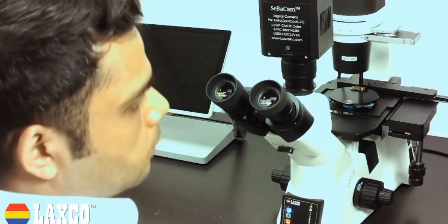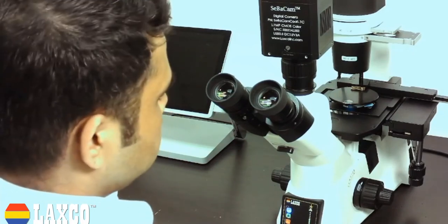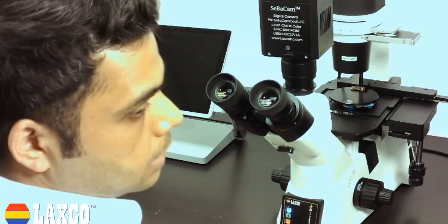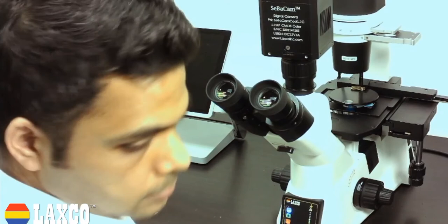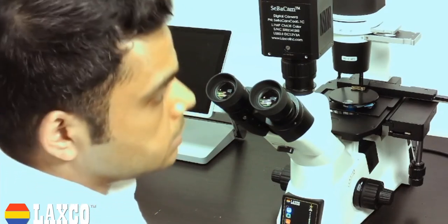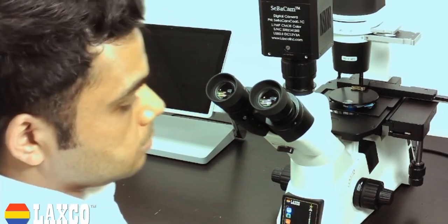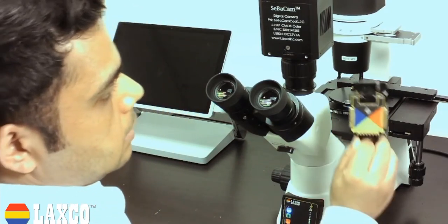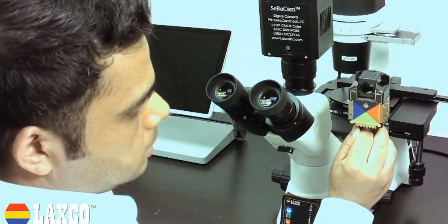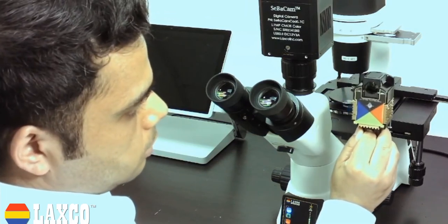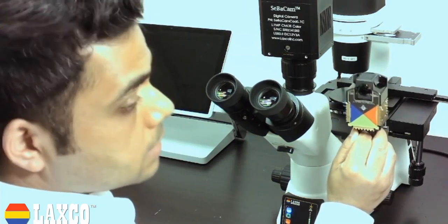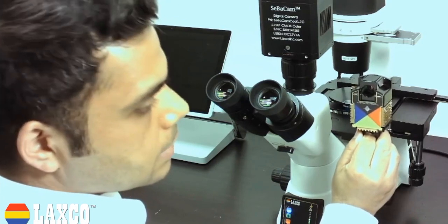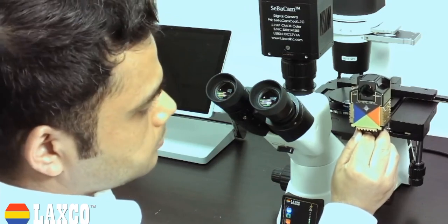The fluorescent system on this microscope is revolutionary. This is a game changing system. If you take a closer look, this is the fluorescent module. This is the secret sauce that is running this system.